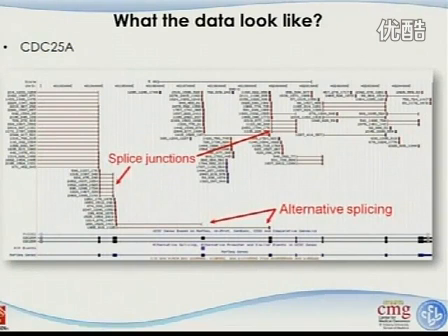Some reads supported the inclusion of the middle exon, others support its exclusion. And in the gene annotation, there are actually two different isoforms, one with and one without this exon. So you can see the data looks like this. If you see potential alternative splicing, it's not only by your inference based on a certain level of accumulation, it is based on the data you see with your eye, and it's more trustworthy for me.